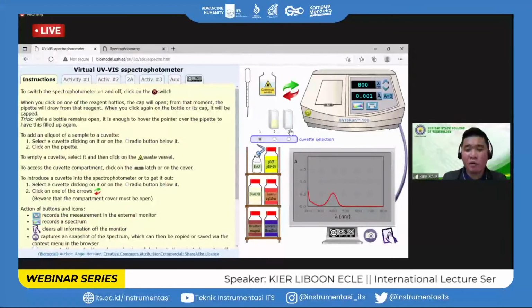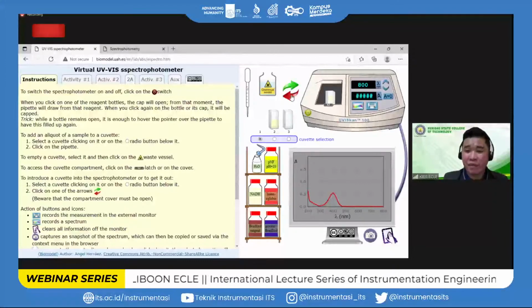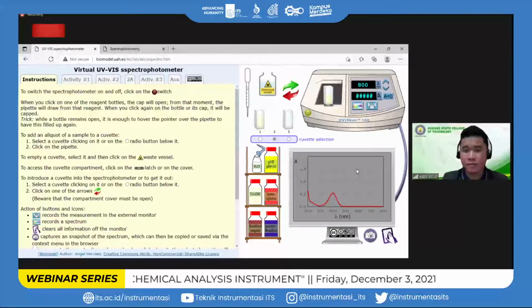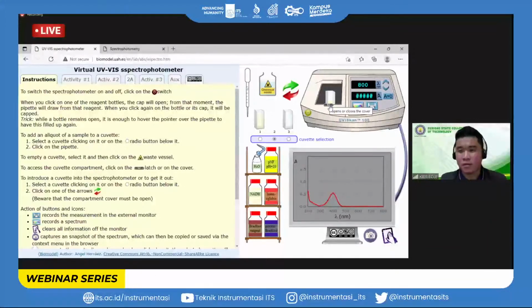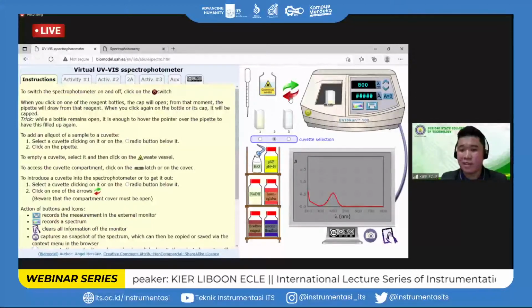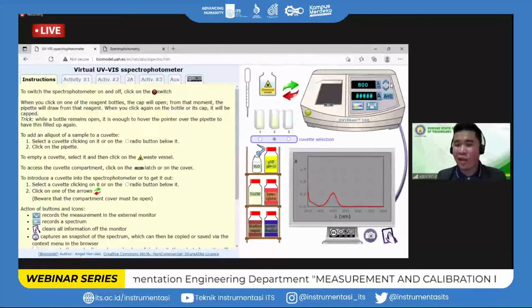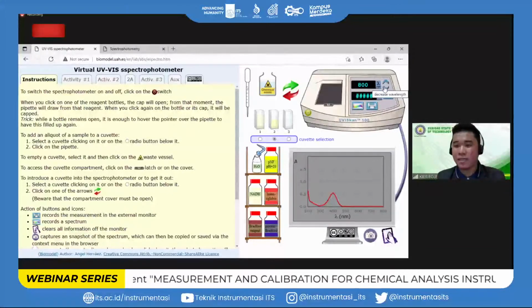So we're going to have now the second solution. The spectrum is not set to 405 nanometers. So, 405 nanometers.